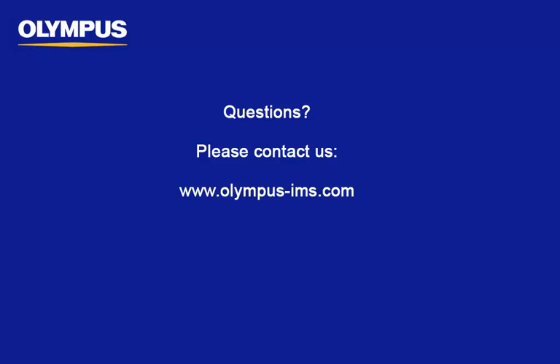In this instructional video, we have covered count and measure within the Olympus Stream image analysis software. We hope this video has been beneficial, and we invite you to contact us directly with any questions.